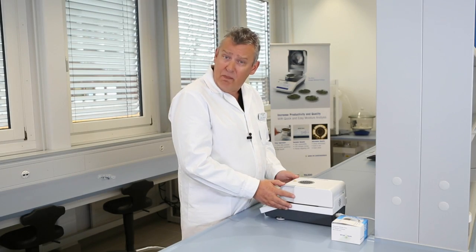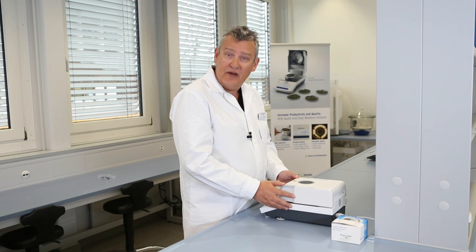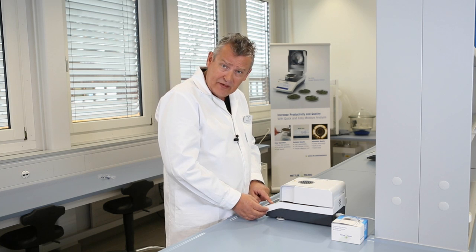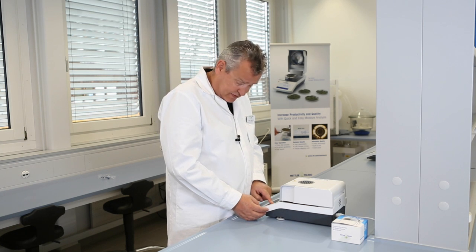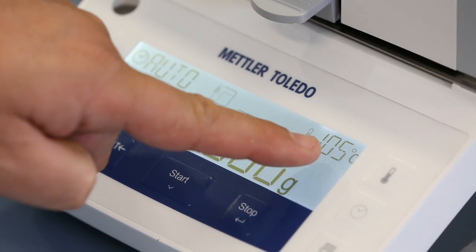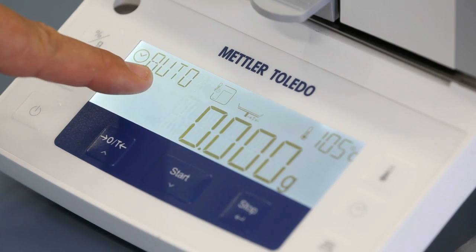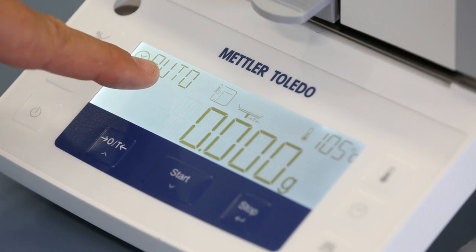Let's perform our first measurement with the HE53. You now see the active measurement parameters — these are the factory settings: 105 degrees centigrade drying temperature, standard drying program, and automatic switch-off criterion.